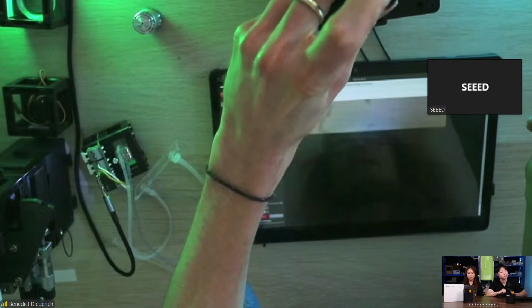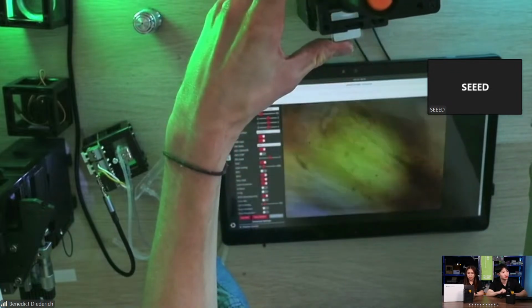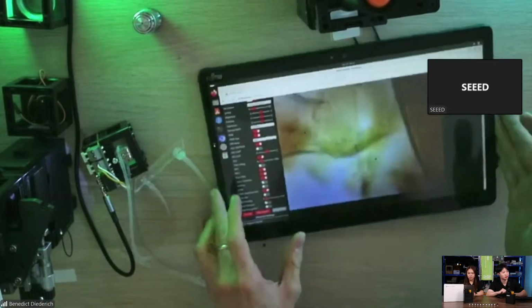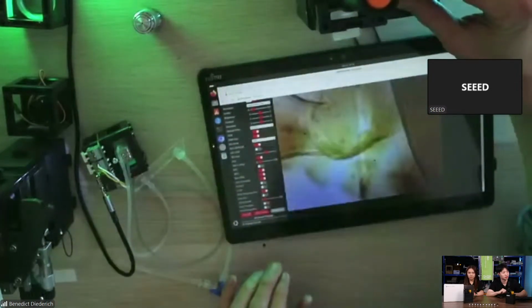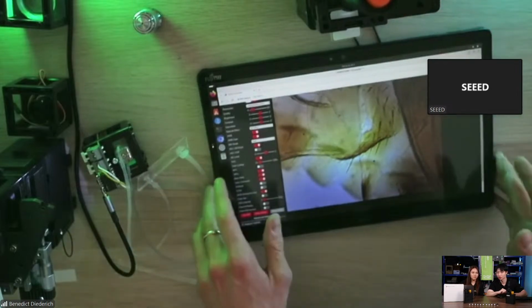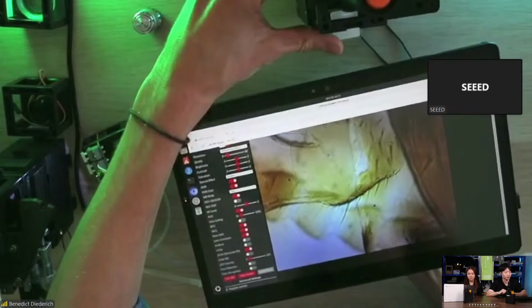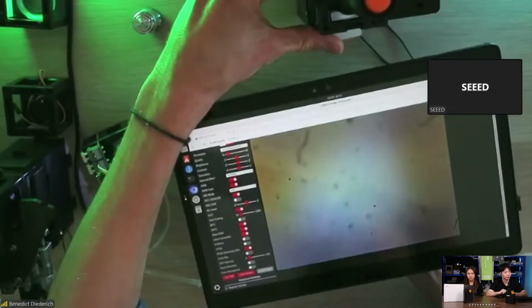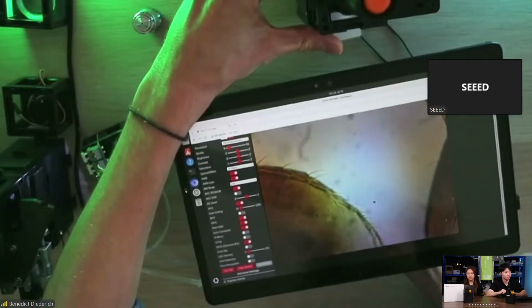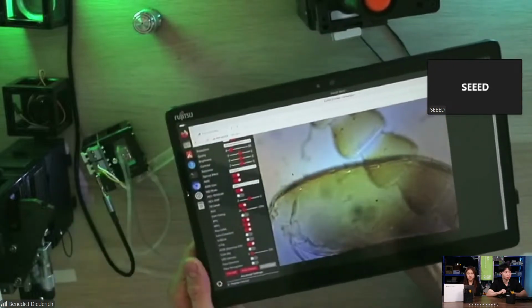Sometimes there's a funky flickering on the torch, so we just turn it on all the time. And what you see here now is some hair structure from the cockroach. You can just essentially move it around and then, for example, look for other parts of the cockroach in that sense.